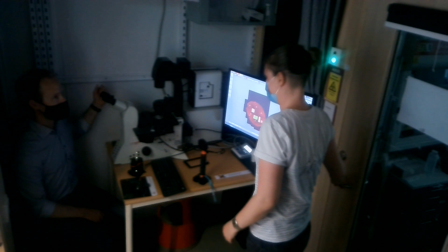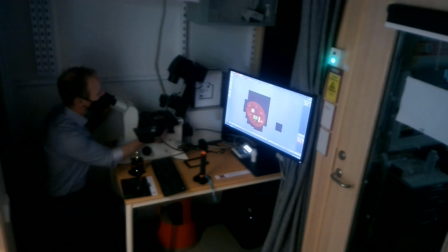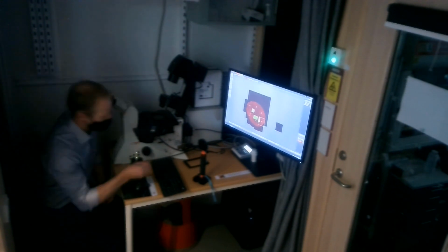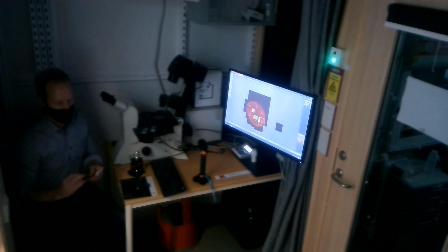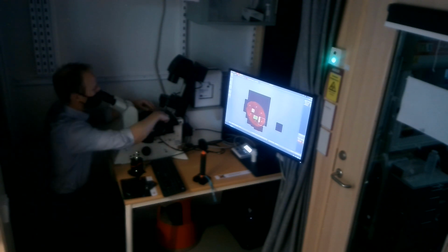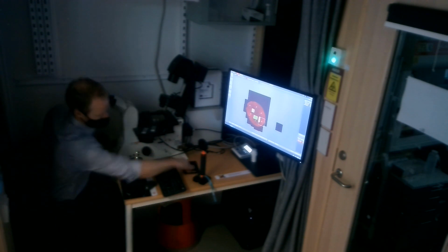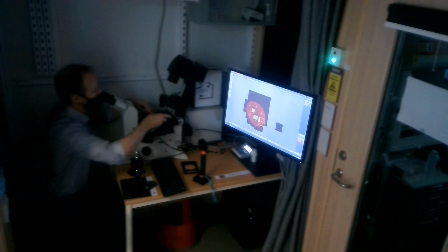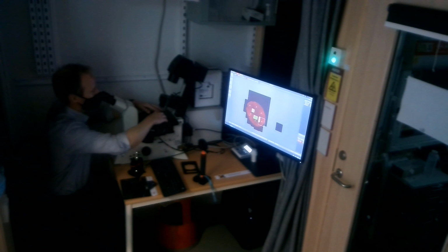Is that in a 96 well plate? Yes. Okay. So with the 96 well plate, we then need to use this insert. So I would change that. Simply take this one, lift it up, pop it out, and then with this one, I will just, as I did before, start from one side and then slide it back till it pops into position.